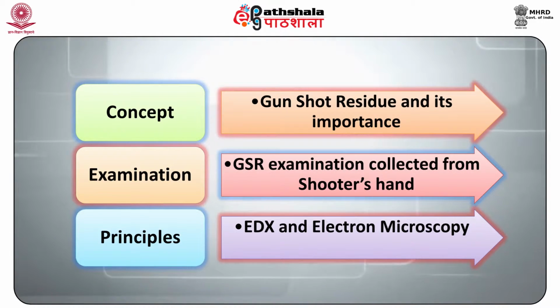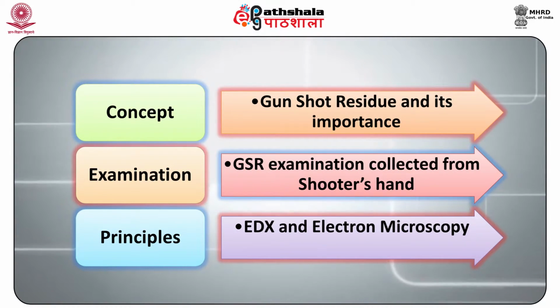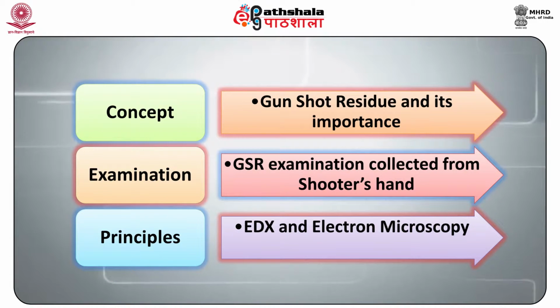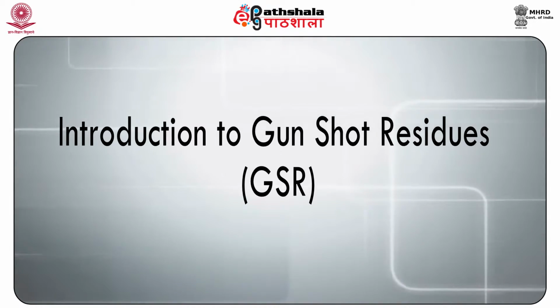Dear students, after studying this module, you shall be able to know about the basic concept of gunshot residue and its importance. Along with it, you will come to know about GSR examination of samples collected from the shooter's hand, and you will learn about the principles of EDX and electron microscopy. Let us start with the introduction to gunshot residues.